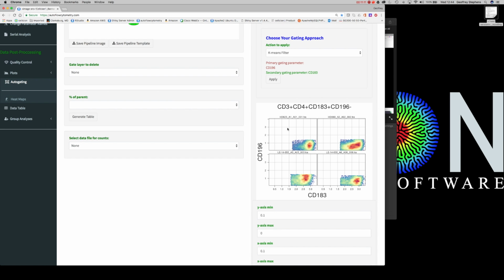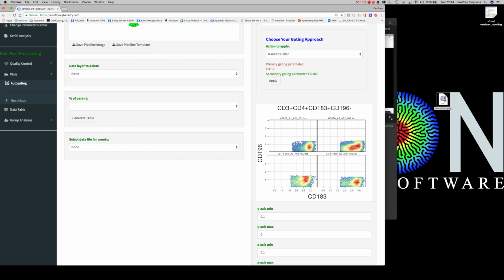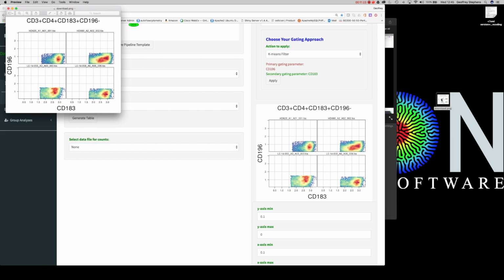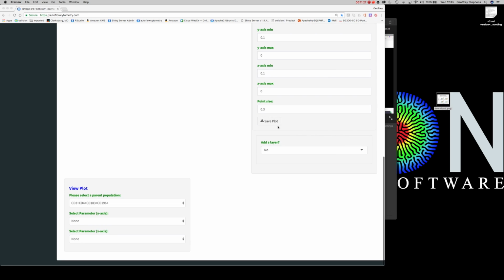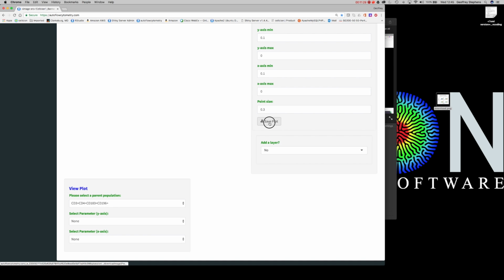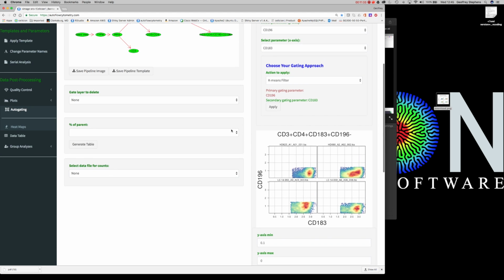So in terms of imaging for presentations, the easiest thing to do is you can simply drag and drop these files, which show up as PNG files, which you can easily import into a number of different presentation or photograph applications, things like Adobe Photoshop, PowerPoint. You can also save the files as PDF if that's your preference.